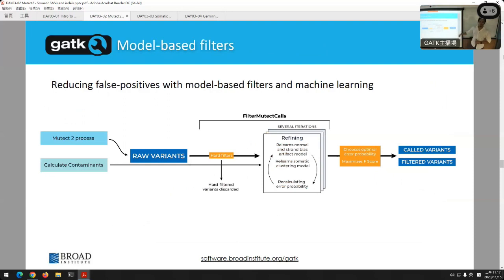You start with a set of assumptions. You say, okay, here's the variants I assigned. Here's the filtering I assigned to them. What is the likelihood? On the statistics side, we use the F-score, in case those of you in statistics want to know. And we say, okay, what is the F-score? Basically, how likely does our assignment of what is good and bad fit the entire call set? And then, as is the case for optimization problems, we do some tweaking. We say, well, what if we change our threshold a little here, filtering? What if that was an error or not? And we say, does that bring the likelihood up for the whole call set?